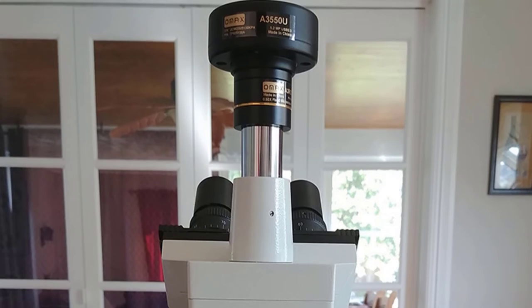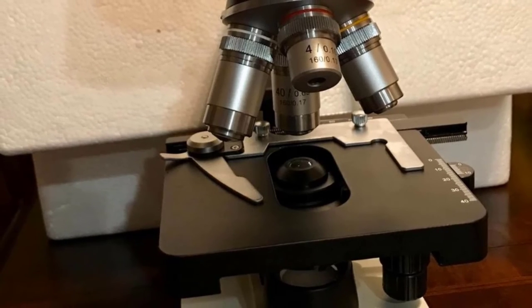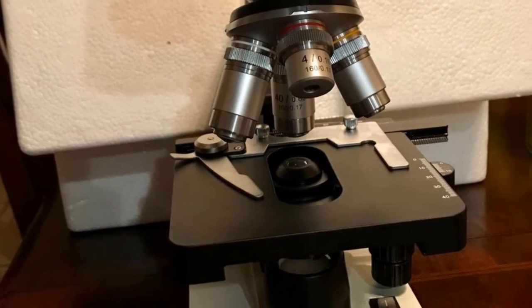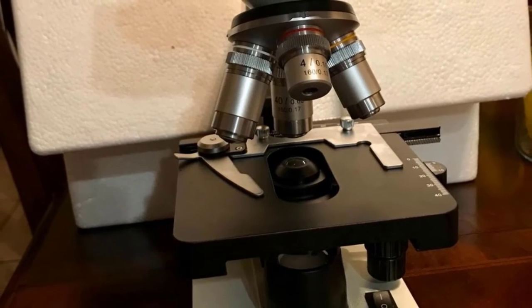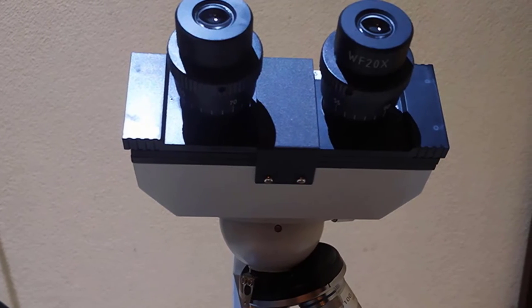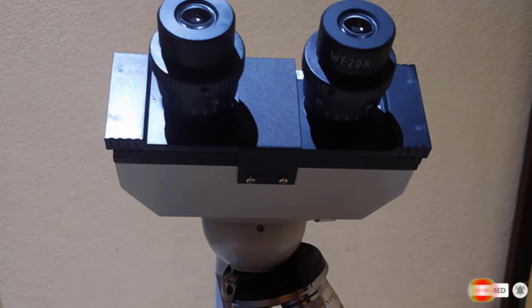The LED light's intensity can be adjusted to the user's liking. But the unique feature of this device is the four objectives used: 4x, 10x, 40x, and 100x that is paired by two eyepiece magnifications at 10x and 20x. The cherry on top is the 100 slides and slide covers that come with it.